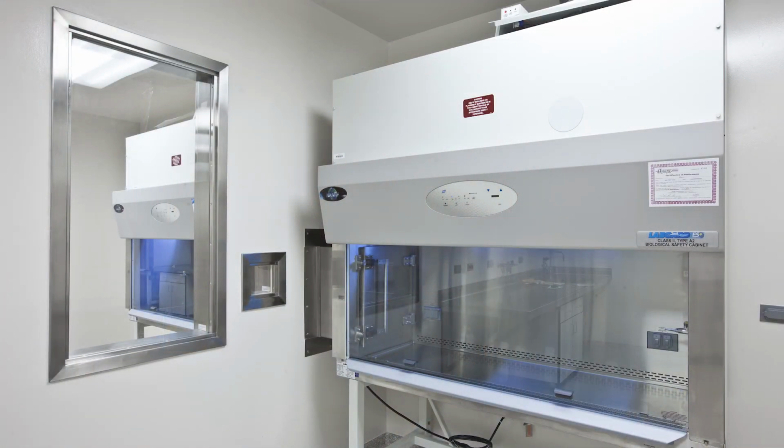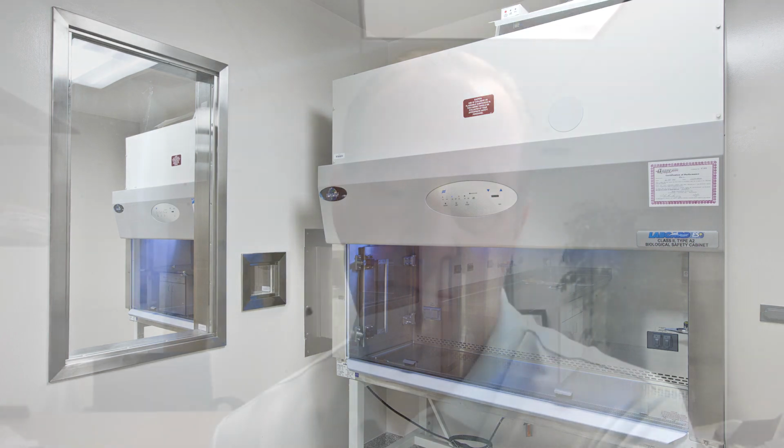And if need be, if it is a contained process, we can get into sealed pass-throughs also that go into associated pieces of equipment. Could be another BSC that's right next to this BSC that houses a liquid handler, where essentially you can contain the entire process from start to finish. So that's why I'm saying you really need to understand this process of how we're going to work with it, how the users are going to work, and through the entire area in order to make sure the system is functional from a process standpoint.